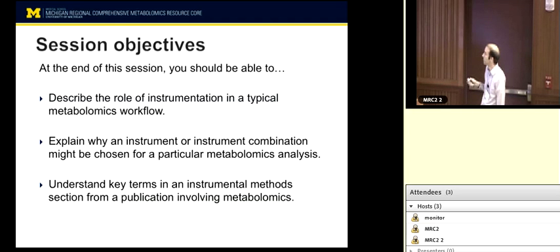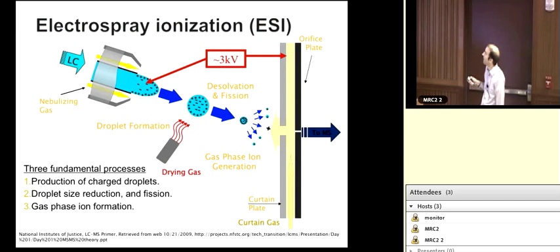NMR is pretty good avoiding matrix effects. We'll talk more about that. Not so good for mass spec unless you carefully manage. Can be coupled to chromatography. NMR can be done, usually doesn't work so well. Mass spec works very well. So we'll talk more about mass spec.